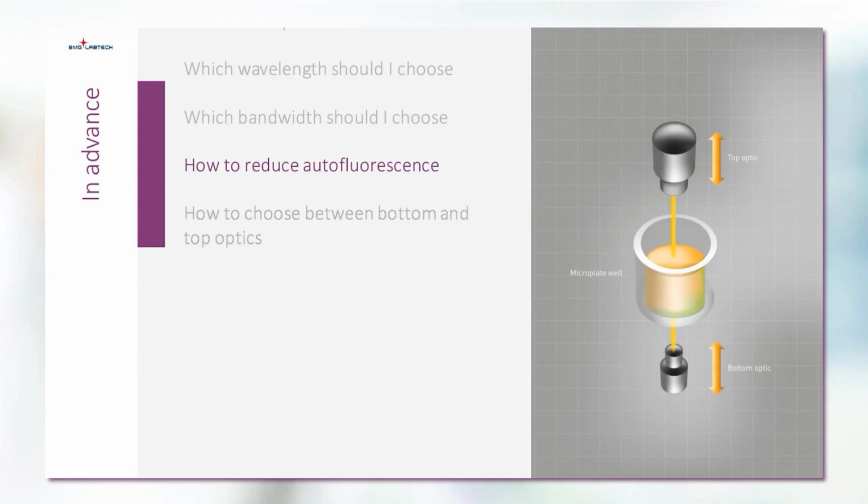With this slide, I would like to conclude the considerations that should be taken in regard of wavelength and bandwidth selection. And with that, I hand over to Anne again, who will cover further adjustments that can be made in the measurement protocols. Okay, thanks for these insights, Martin.